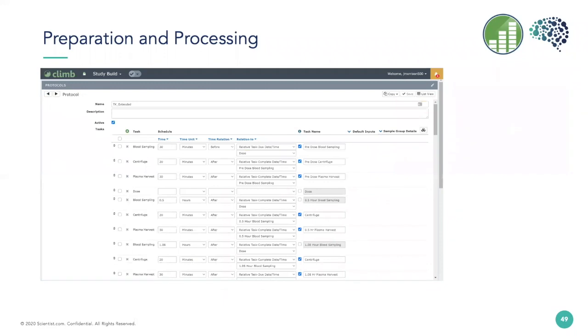All right, so we've been looking at how the study director brings those study design or experimental templates in. We've been looking at how the scheduler and the technician goes into that collection screen to either refine the schedule for overlapping time points, or actually do the collections and do your signature there. But how is that all actually created?